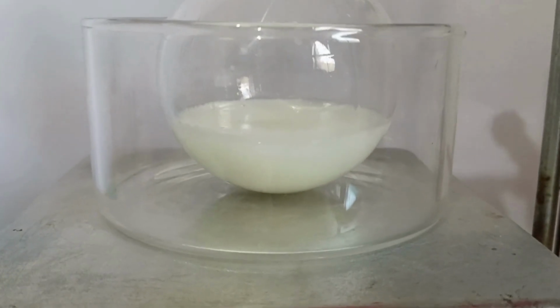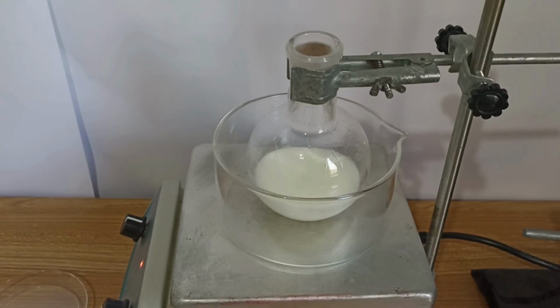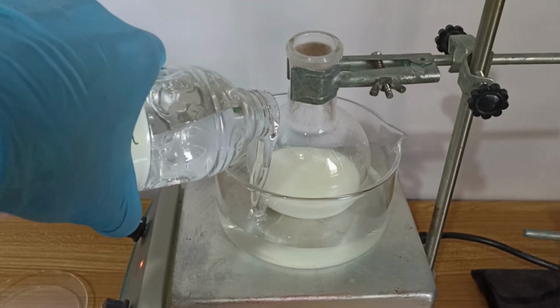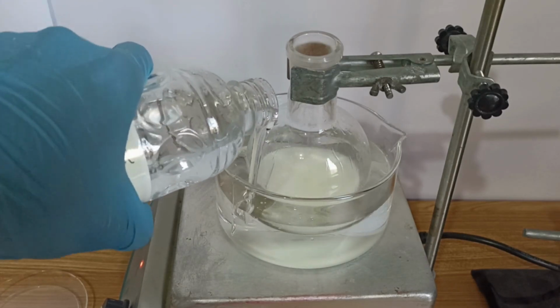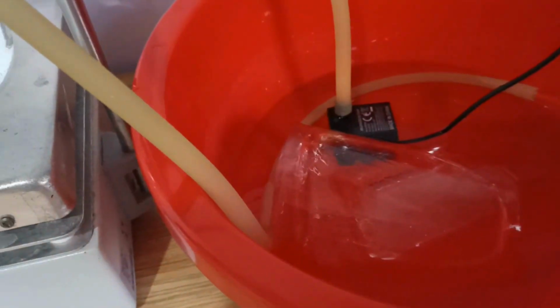A paste is quickly formed. As a recommendation, add glycerin to the bath in order to get better heat transference. Turn on the heat and put the reflux condenser. The system looks something like this.